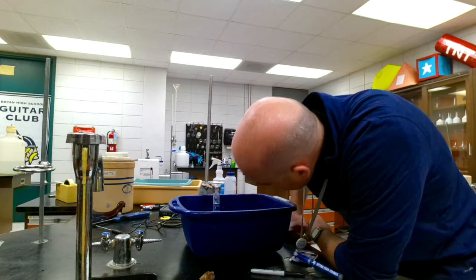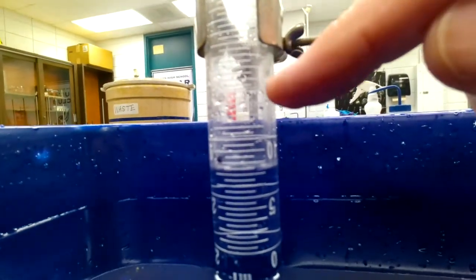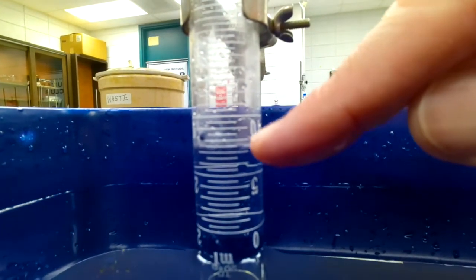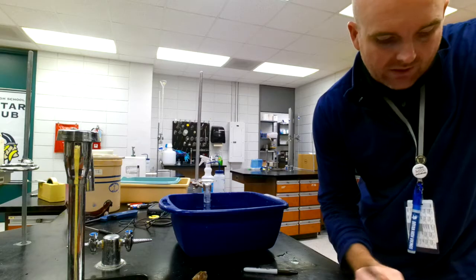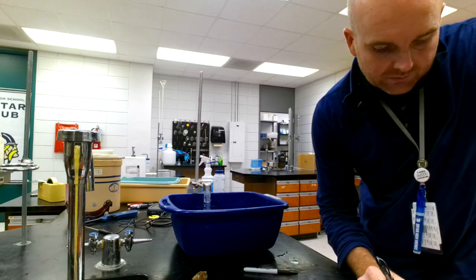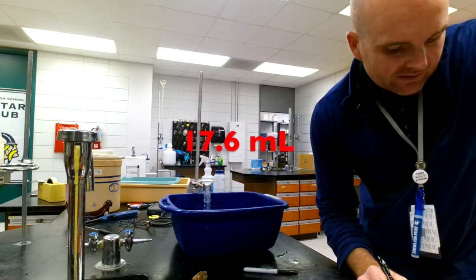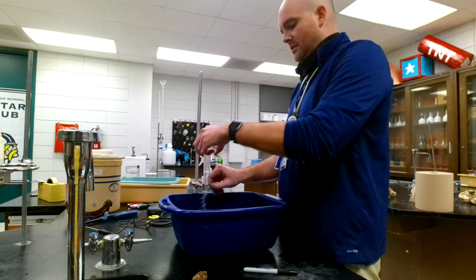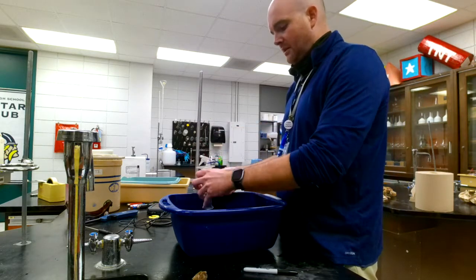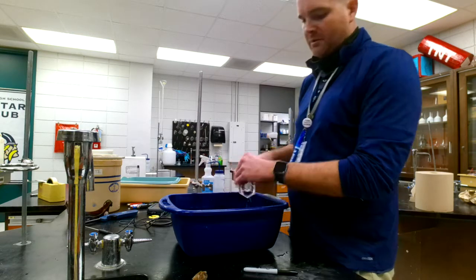Now we'll look at that volume. If you look at that, it is actually about 17.5. If this is 5, 10, 15, and then 16, 17, then it's about 17.5 right there. Okay? Actually, I would say 17.6. Whatever, Mr. Russell, I'll write down whatever you say. Just show me what's going on.